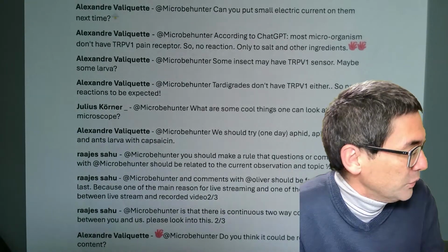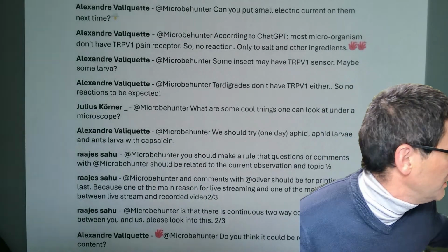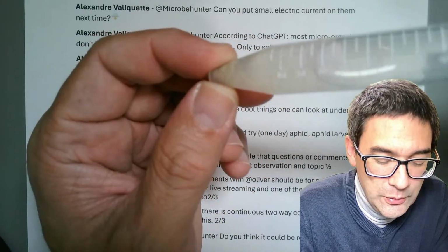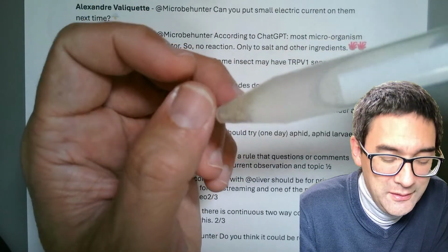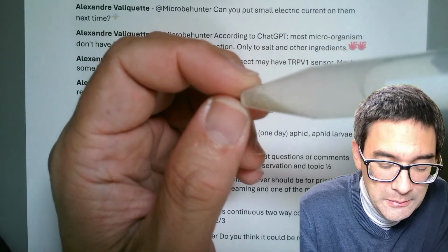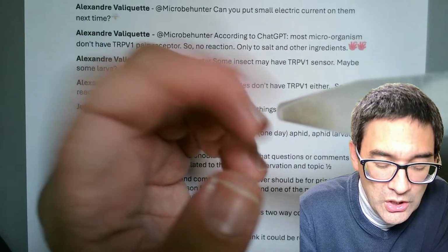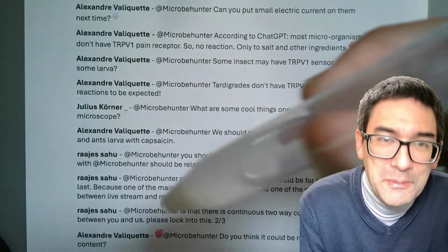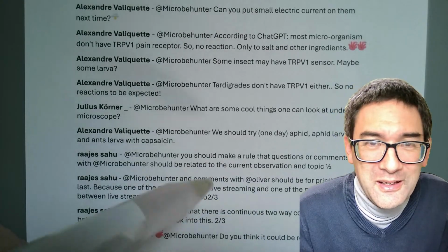I hope, and I don't know if I will be successful, I hope that I'm able to show you next week the diatom extraction technique with hydrogen peroxide. This is still something I'm working on. The sample in here is now white, completely bleached, but originally was dark green because there were algae with diatoms in here. But I think not everything is yet finished. Yeah, and I think I need to get myself a stronger hydrogen peroxide solution, and then maybe it's going to work a little bit faster and a little bit better. But that's essentially one of the things that I still have on the program, and which I would like to show you sometime in the upcoming live streams.